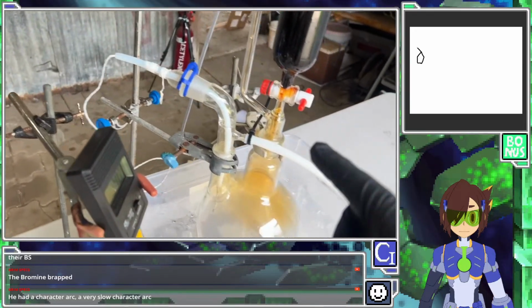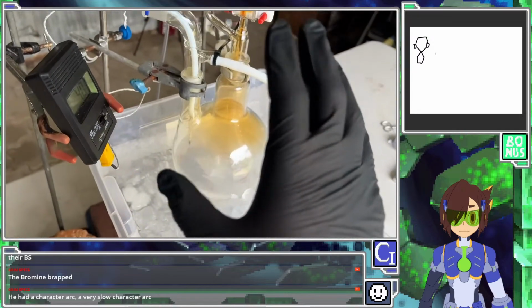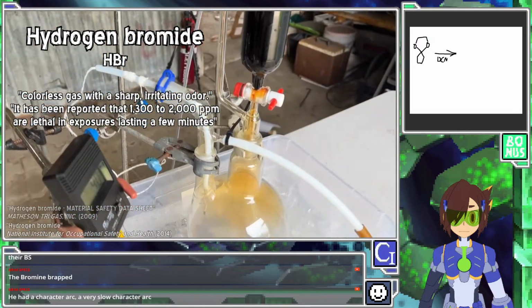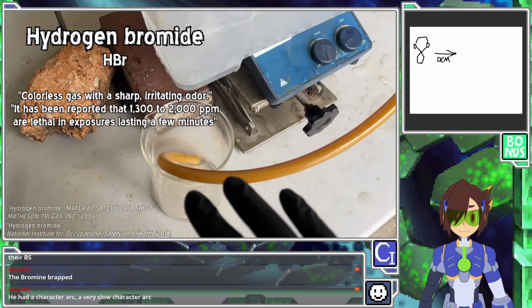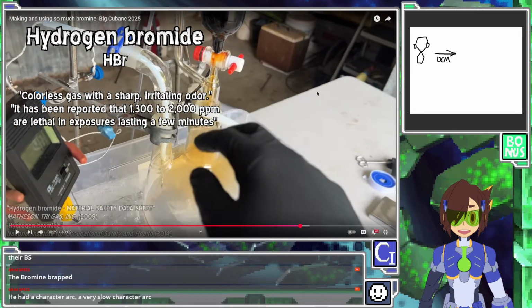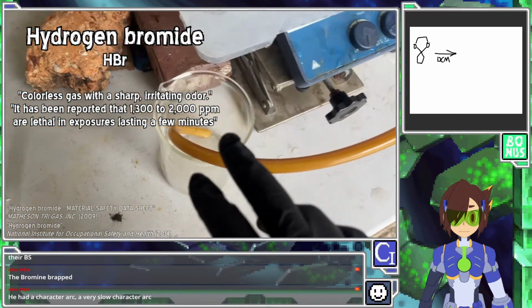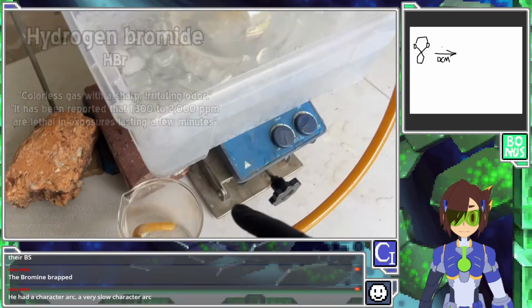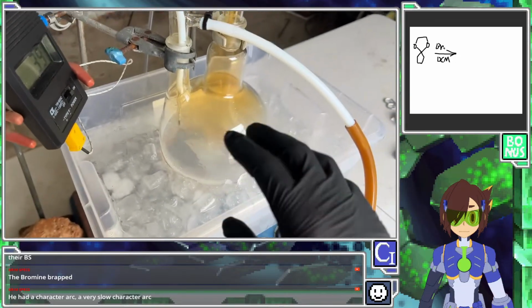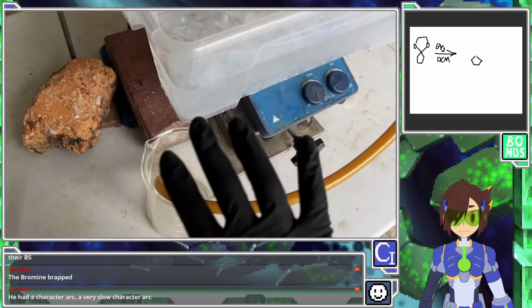The argon is coming out here and just pushing through a little bit of water, because this reaction does generate some HBr gas, hydrogen bromide, the heavier cousin of hydrochloric acid. We can't just seal this up and let it get pressurized, because that would be a very bad idea. But we also want to keep air and moisture from the air back out of there, so this argon is flowing through to keep it dry. We are using DCM as a solvent, which I think will dissolve quite a bit of the HBr, so we don't expect a lot of outgassing, but this should still control it.